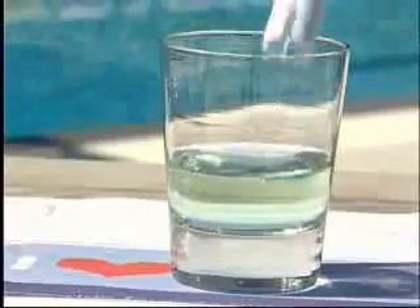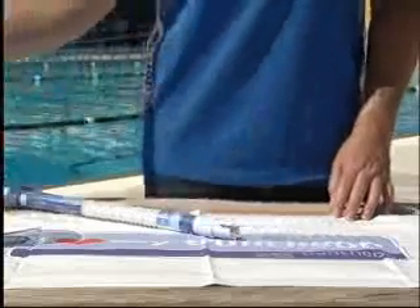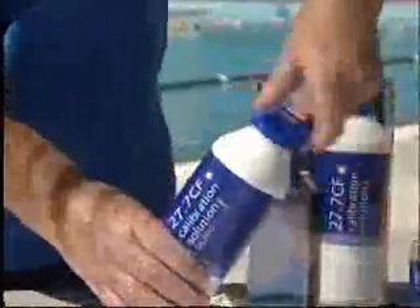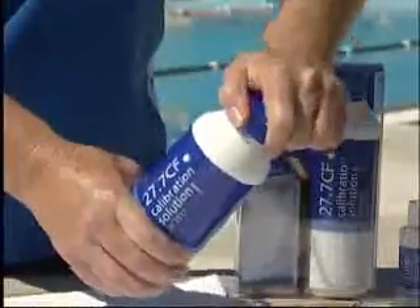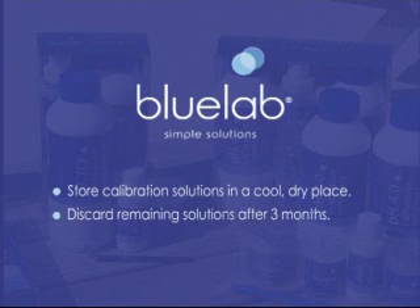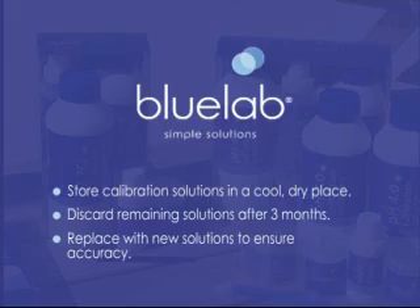When the truncheon accurately measures in the standard solution, discard the standard solution. Do not put it back in the bottle. This will avoid contamination of the standard solution and remove the occurrence of inaccurate readings. Remember when storing your standard solutions to keep it in a cool, dry place. After 3 months, discard any remaining standard solution and replace to ensure accurate readings.